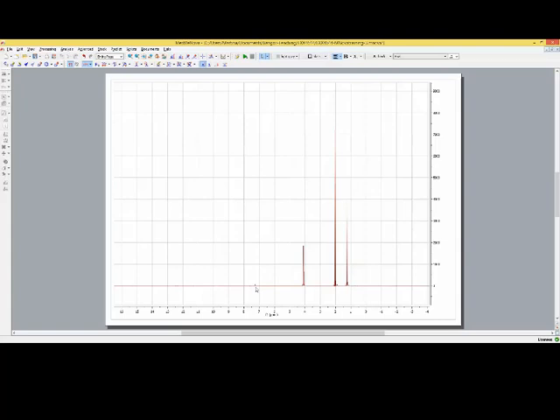Where is the signal coming from? This is my NMR reference. Every NMR spectrum has to be referenced and this can be done either down to an added reference. This could be for example TMS, tetramethylsilane, which would end up at zero. Or you can also use residual non-deuterated NMR solvent. This spectrum has been run in chloroform CDCl3. But there is a small amount of CHCl3, normal ordinary chloroform. And this we will use for the reference.